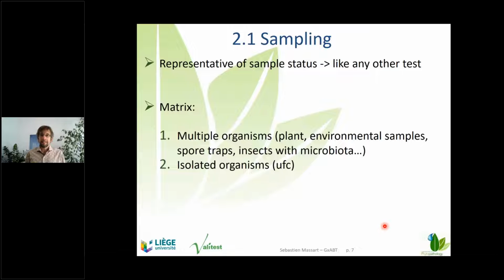But even if you have a single insect, you can sequence it, you will also generate sequence from bacteria. And if you sequence, for example, the RNA from RNA viruses. So have in mind, we always work with complex samples, and high throughput sequencing is able to detect potentially any living organism in a sample. There are restrictions, because depending on the methodology, you are able to see an organism or not. But think about it, we have a complex matrix anyway, which can complexify the interpretation of the results.